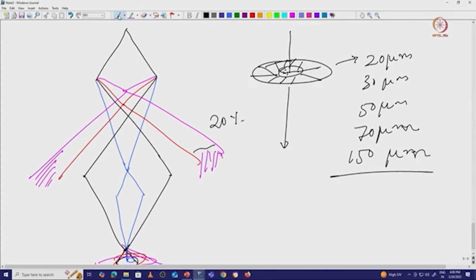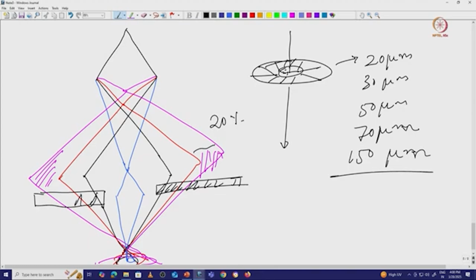So if I just finish that ray, this ray is going like that, this ray is going, and then I have a red light here. Now I have an aperture size that is this big. In this particular case you can see that almost 50% of the electrons I am trying to block with this aperture. When I am blocking 50% of the electrons, this black ray is coming like this and then it is merging through this particular point.